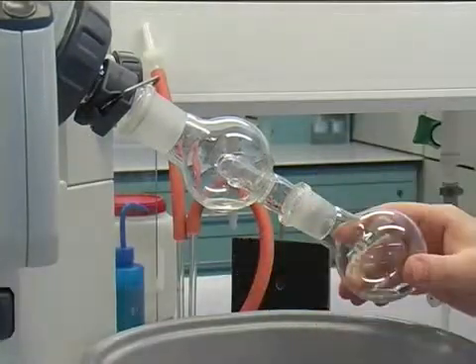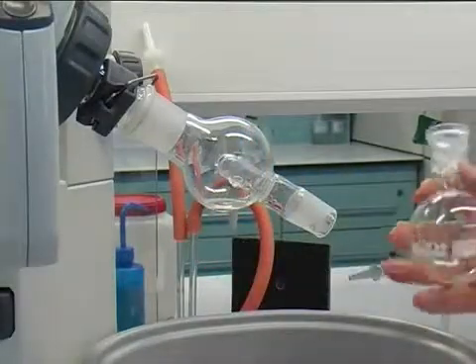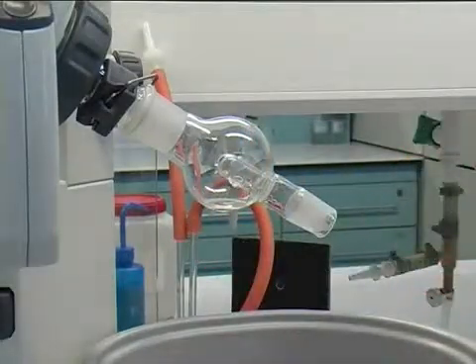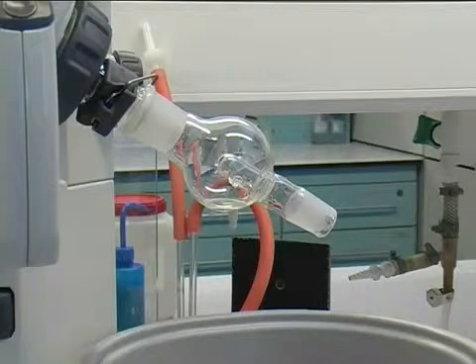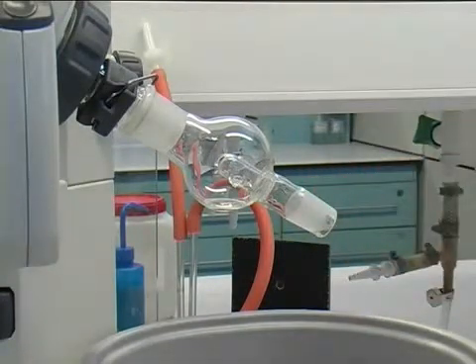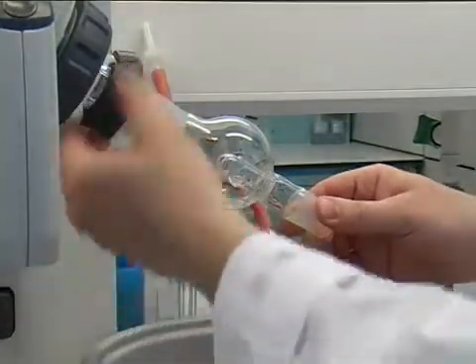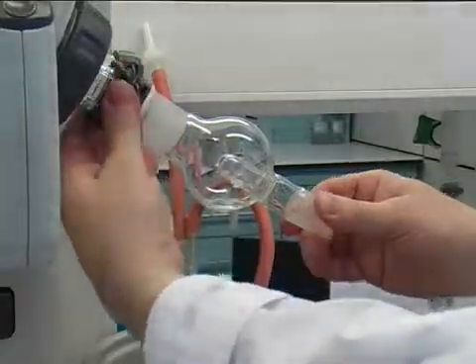If your splash guard has some liquid inside, you might want to either keep that liquid and flush it down to your round bottom flask if it's your product, or clean it into the solvent waste if it's something you're not interested in. To remove that, just turn the top part slightly to loosen it. That's how it's designed.